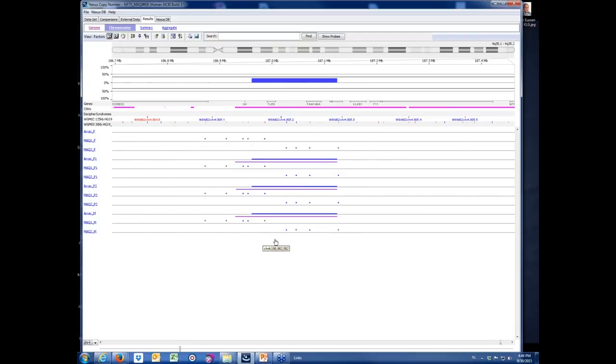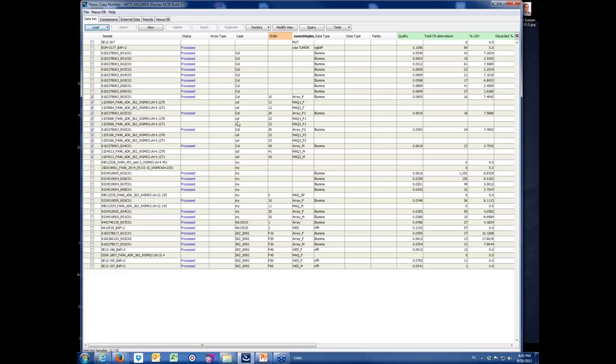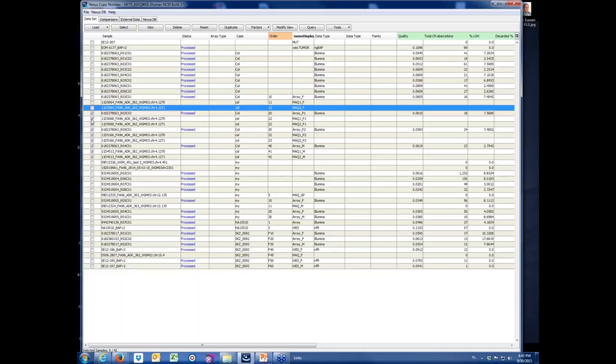We had some problems with the DNA quality of the mother, because there were some amplicons not passing the thresholds, but they are almost, just not passing the threshold. I would like to put it in because directly you can see that there's a DNA problem with this sample of the mother in the concentration. Focusing on this, we see also some regions where the MAQ assay is confirming the B allelic information, and for that I want to limit the amount of data, and I will throw out a few of these.